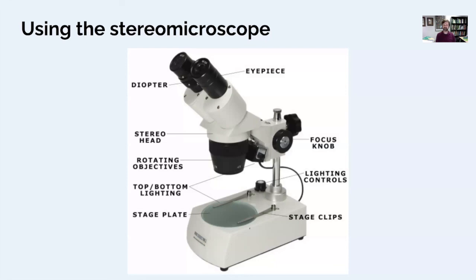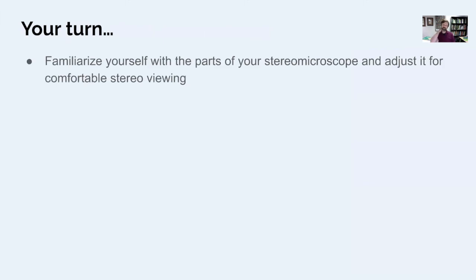And a big advantage of this kind of scope, which we call the dissecting microscope, is that you can put your item on the stage and actually manipulate it while it's there. So we're going to be brushing fruit flies around. You can touch them, flip them over. Not something you would do with a compound microscope that has just the microscope slide on there. So this works at smaller magnification, but is important for boosting the view of something that you might want to actually manipulate.